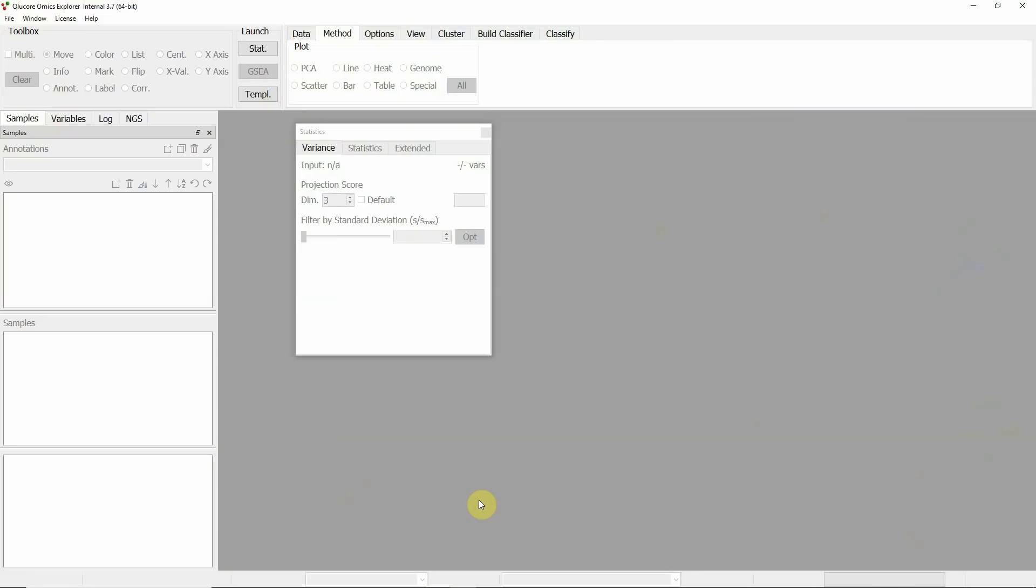There are several ways to import RNA-seq data. In this film, we'll show the direct import and normalization of a BAM file.